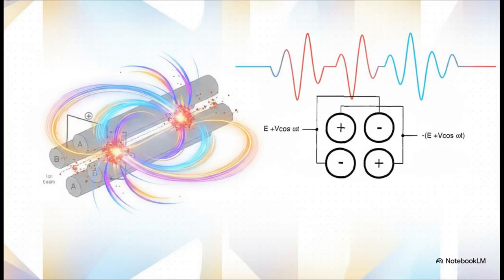And this brilliantly illustrates how it works. The quadrupole operates using 4 parallel metallic cylinders. We apply rapidly alternating direct current and radio frequency voltages to these rods. As ions travel down the center path, they begin to spiral. By precisely tuning these electrical fields, only an ion with a specific mass will have a stable trajectory and make it to the end. All the other ions spin out of control and collide with the rods. We can literally scan across the entire periodic table in mere milliseconds.